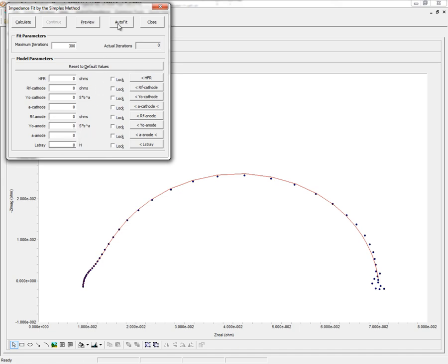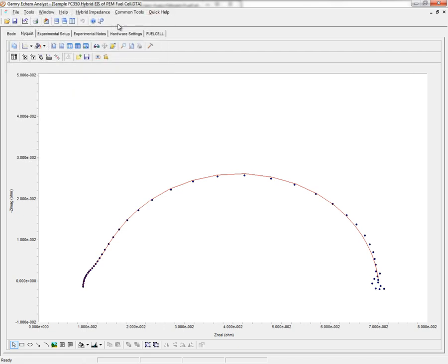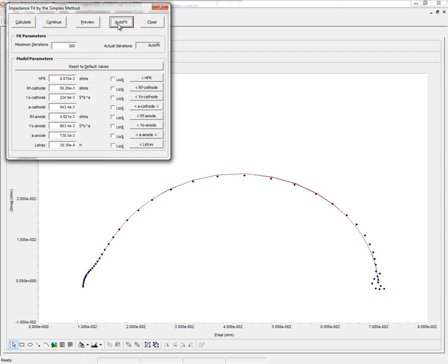Now, I simply click on the Autofit, and it starts the initial fit, and we can see it actually overlays, nearly overlays the original fit done using the Preview and Calculate.